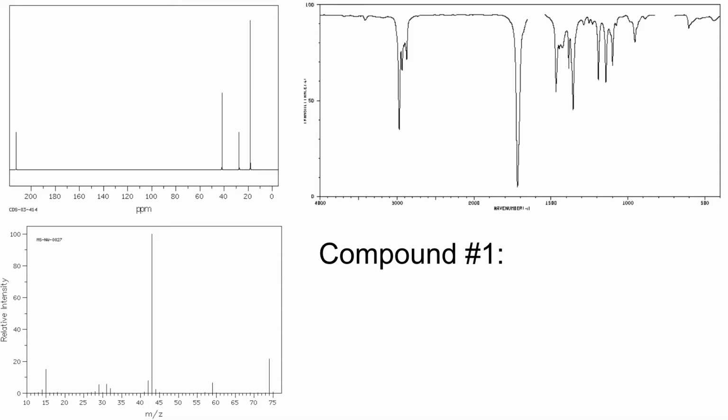3-methylbutanal. Ooh. I disagree. I think it's a ketone and aldehyde. You think it's a ketone? Why, when it could be an aldehyde or a ketone, what swayed you that it was one over the other?